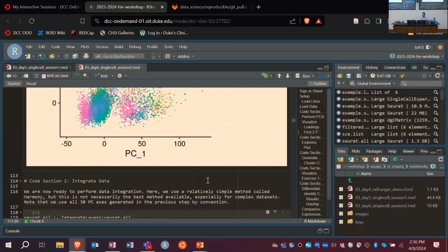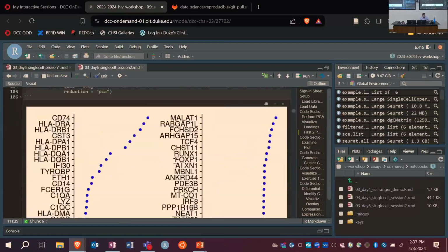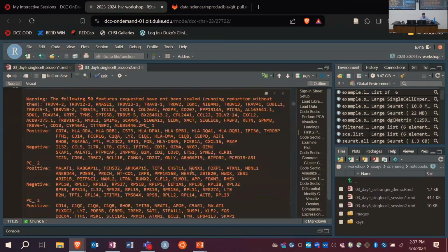Okay, yeah. The whole scale data warning and scaling data. I was under the impression that after normalizing, you still have to do an additional ScaleData function for PCA and for any visualization. Right? So the Seurat authors, I think are fairly clear, and I can check this, but they use the Pearson residuals as the scale data because they are essentially scaled. If you recall, the denominator of that Pearson had the sigma for the gene. So essentially the counts are kind of scaled by the variance for that gene.